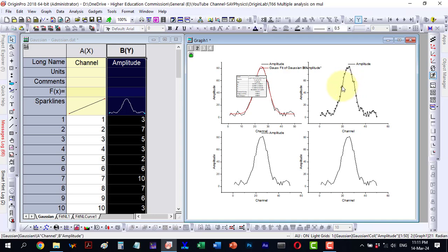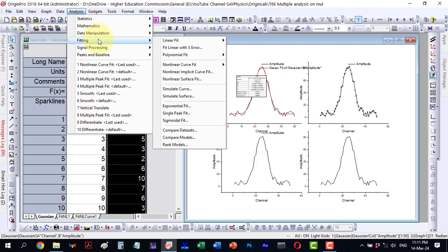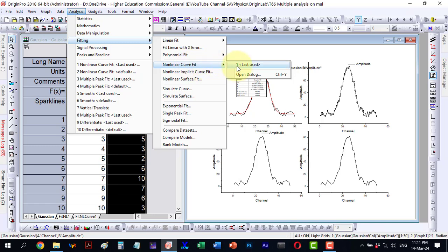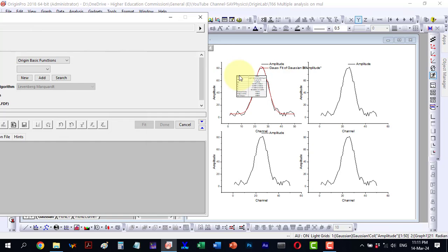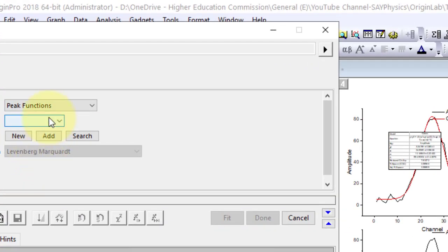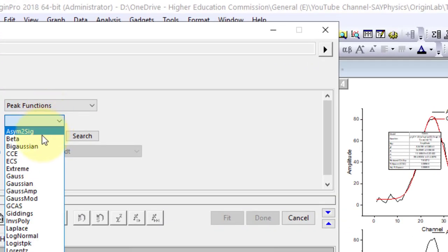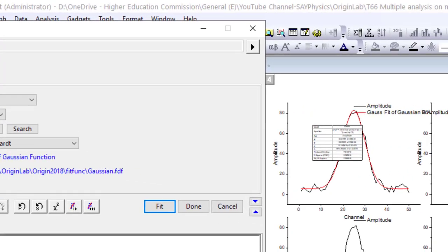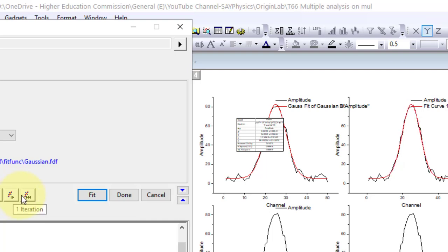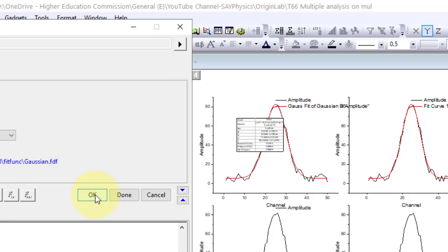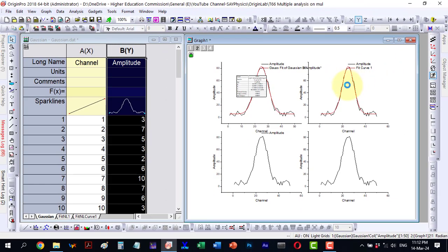Next, I select this one and return to analysis, then fitting. Here, I navigate to the non-linear curve fit and open the dialog. Under peak functions, I choose the next function, Gaussian, and proceed with the fitting. I perform a few quick iterations and continue fitting until convergence. Once fitted, I click OK and the data will be displayed here.